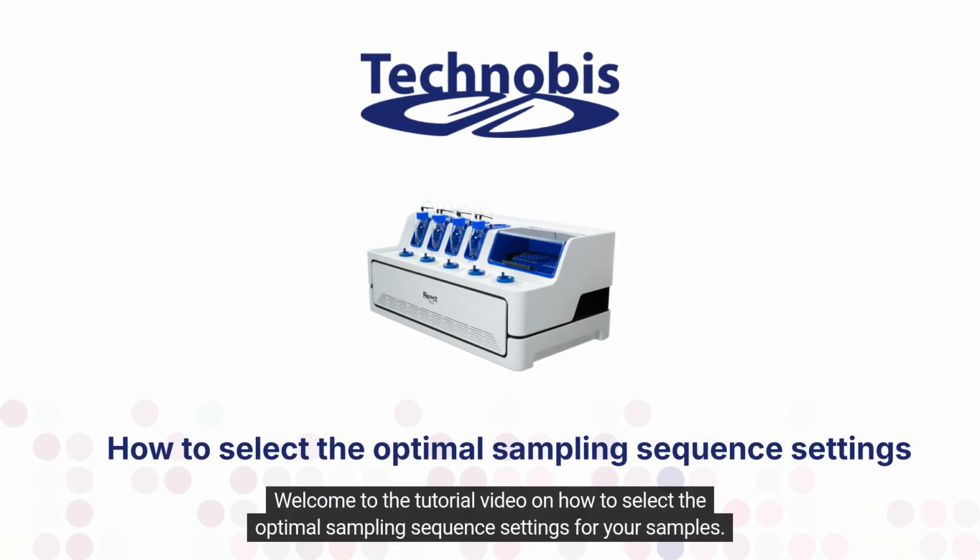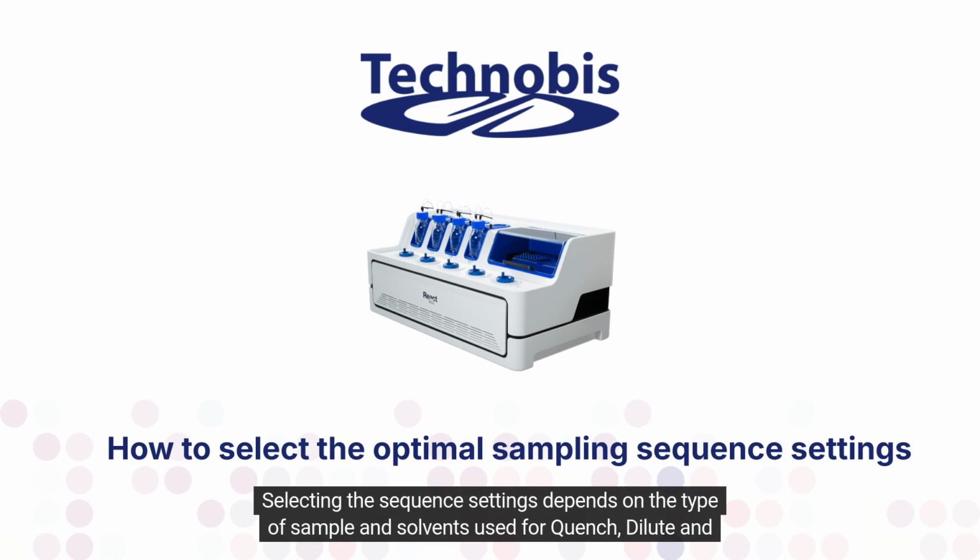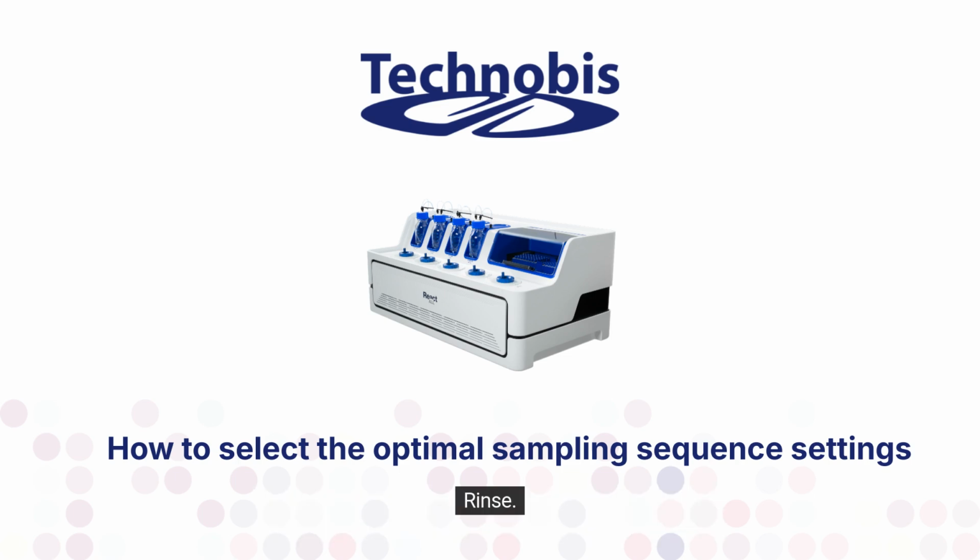Welcome to the tutorial video on how to select the optimal sampling sequence settings for your samples. When performing an experiment, it is important to select the appropriate sequence setting to transport your sample to the system. Selecting the sequence settings depends on the type of sample and solvents used for Quench, Dilute and Rinse. We will discuss each type in this tutorial.